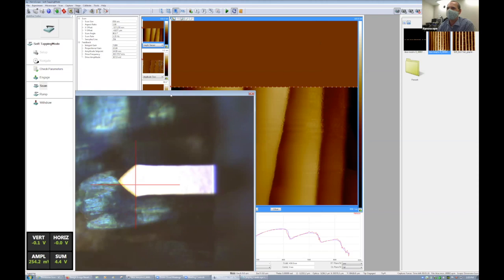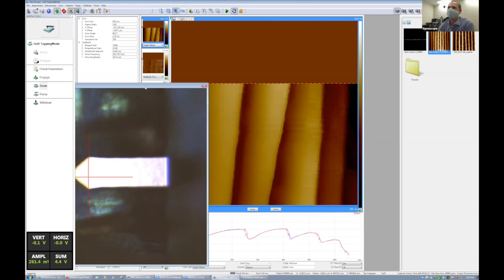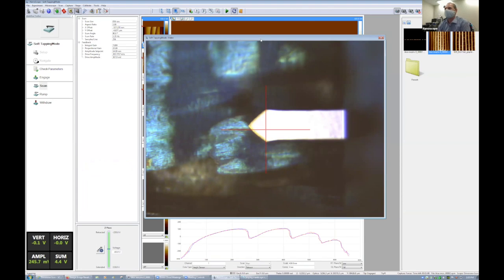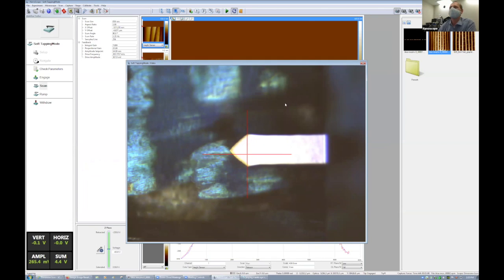Yeah. When you're looking at this structure that we're seeing right now, it is actually looking along the edge of one of those single little ribs in the picture. But unlike the SEM, the sample is not coated with anything. There's no vacuum involved. I don't have to worry about charging. I just stick it in there.